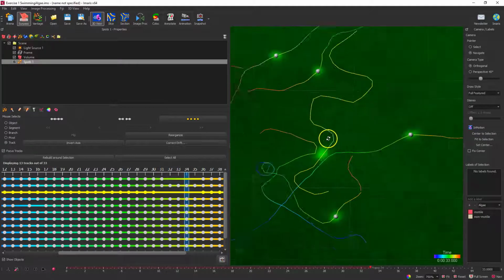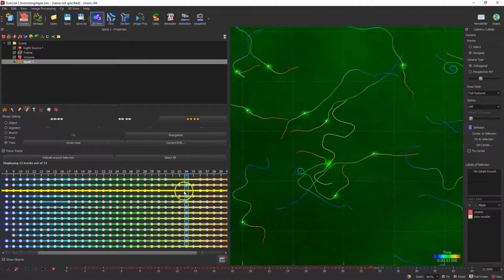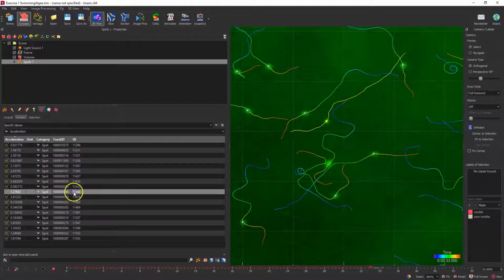You can just connect the track segments that you know should go together, and you have a complete track. It's that easy. So when you look at the data, you won't get a 0 at that time point. You just get a no data value at that time point. So here we can go look, and we see track 11468.